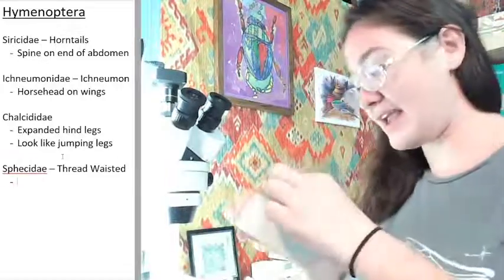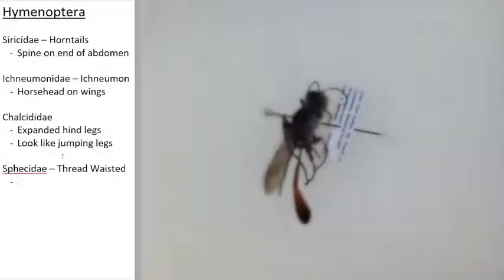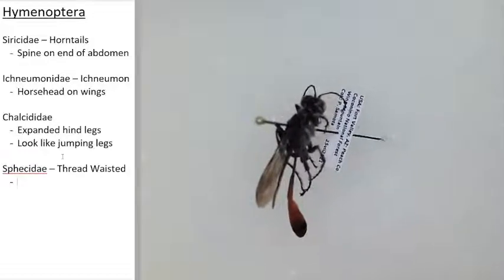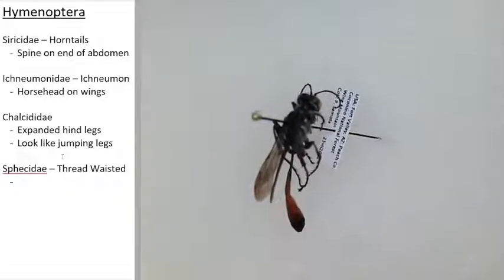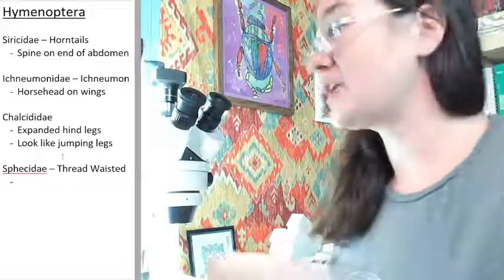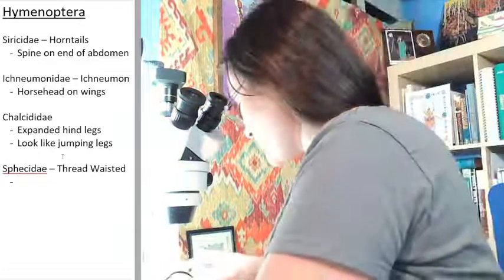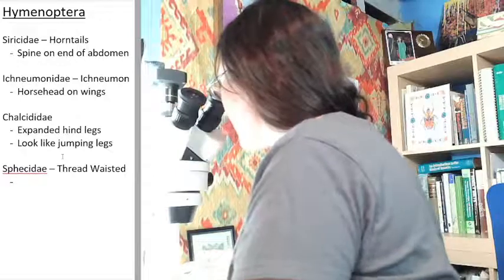So we can look at it on the pin really quick so that you guys can see. If you look at, there's the head, the thorax, and then you'll notice that the abdomen has a very, very thin waist, right? They almost look thread-waisted, right? So that's going to be one of the site characteristics. You can kind of see that they have that very thin thread waist. But if we were looking at a sphecid under the microscope and trying to identify it, trying to differentiate a sphecid from other wasps.